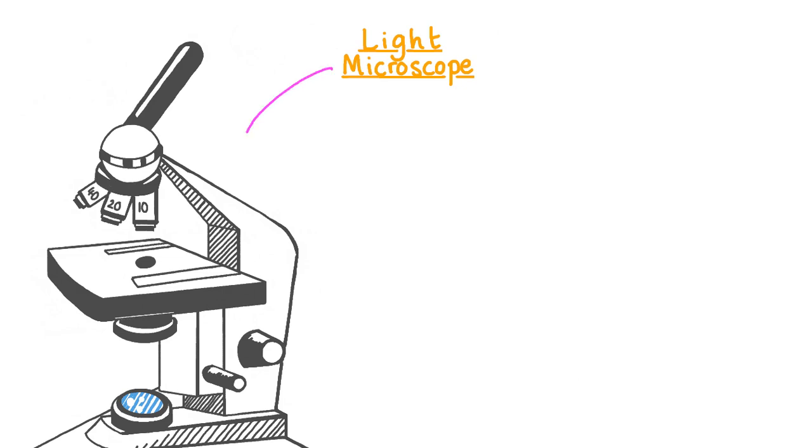This diagram is of a microscope, a tool that is used in the study of microscopy and in studying all the tiny aspects of the living world. The organisms, or part of an organism, that we look at using a microscope are called specimens. This small yellow structure represents a single organism called an amoeba, and it is placed onto a small glass rectangular sheet called a slide.